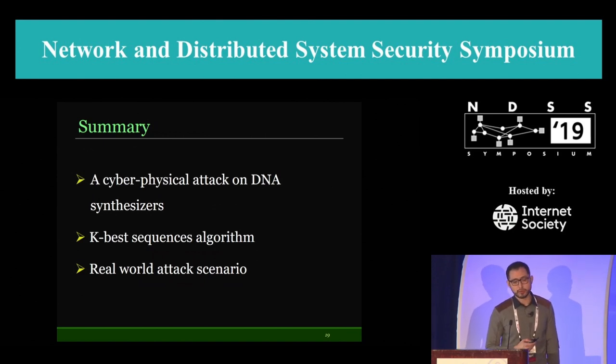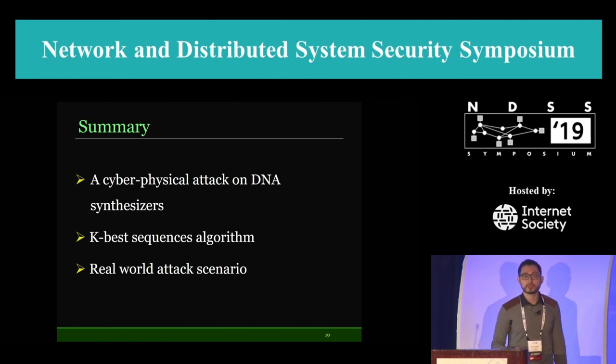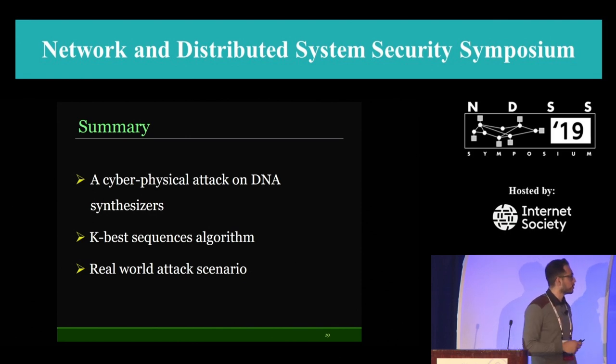To summarize my work today, I introduced a new attack methodology to steal the order of bases in a valuable synthetic DNA sequence. I proposed an efficient approach to extend the predictions from only one possible DNA sequence to K-best DNA sequences. And at the end, I tested the attack methodology in a real-world scenario and proved that it's going to work.